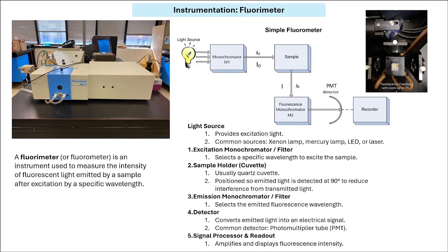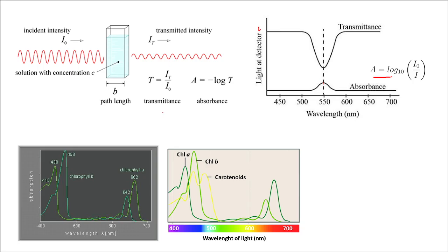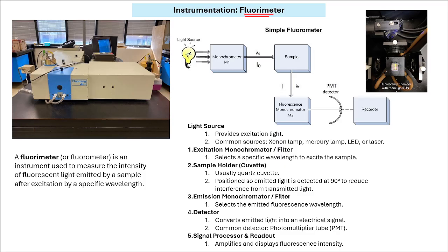Now this is the instrumentation for the fluorimeter. There are some very key differences that you'll find in the instrumentation setup and the sample chamber when we are recording absorption and when we are recording fluorescence. Using this fluorimeter, we are recording the fluorescence emission given by a particular kind of sample. If you remember, here the light is passing straight, but here you would see a 90-degree angle.